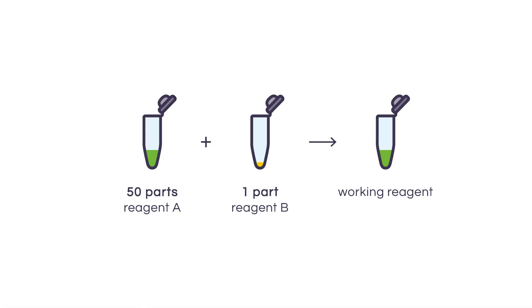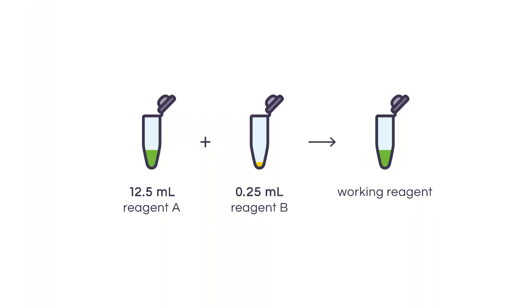To prepare our working reagent, we're going to mix 50 parts of reagent A to 1 part of reagent B. Since we need a minimum of 10 milliliters, we're actually going to prepare a little more to have round numbers and reduce the chance of pipetting error. In our case, we're going to mix 12.5 milliliters of reagent A with 0.25 milliliters of reagent B. That solution will be turbid at first, but once it's perfectly homogenized, it will become a clear green solution that is stable for one week at room temperature.